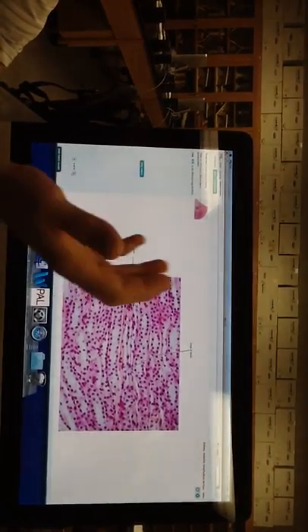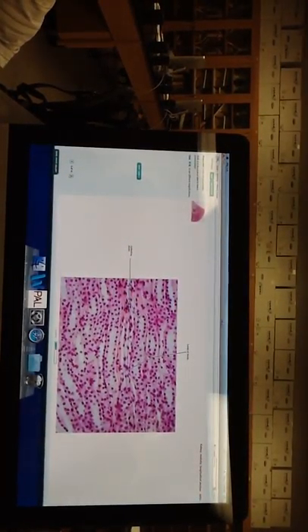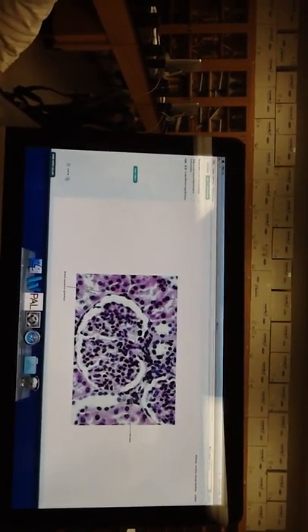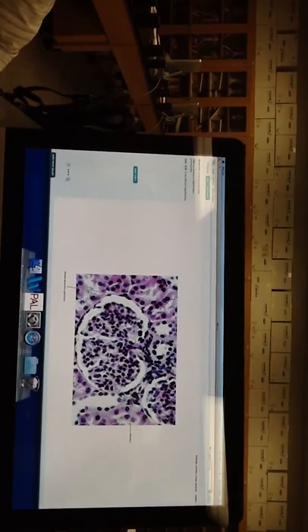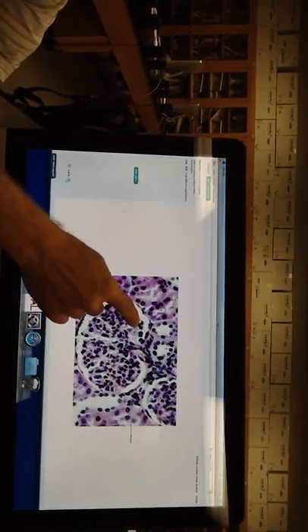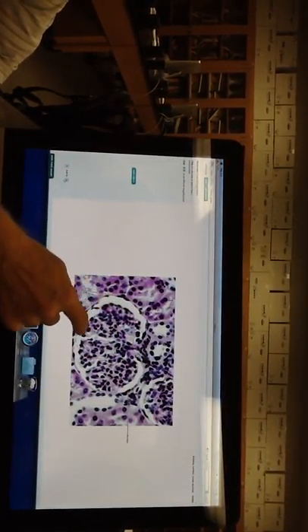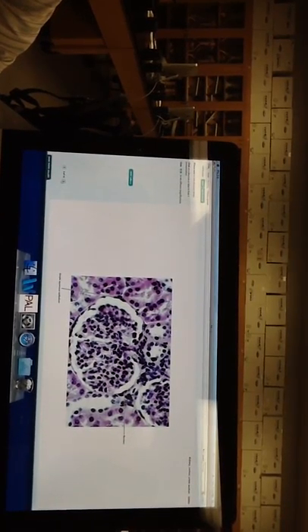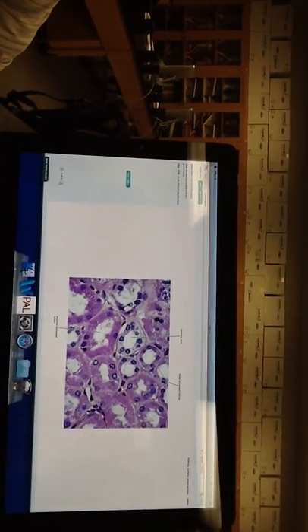That's just collecting ducts, where the urine collects, lots of tubing. You can see these cells tend to be secretory glandular-like cells because they're even moving fluid in and out of those ducts. And that's pretty much what the whole kidney looks like.